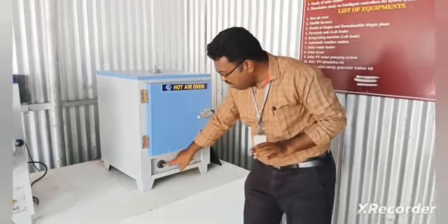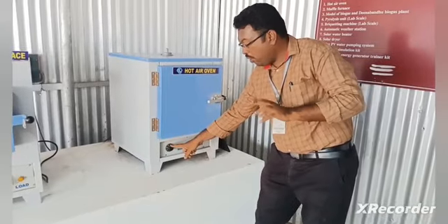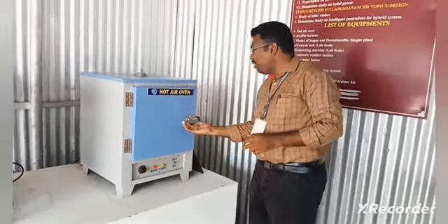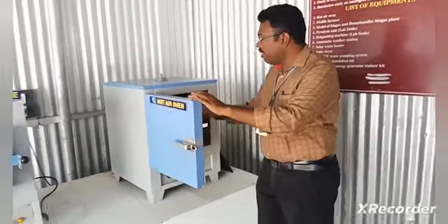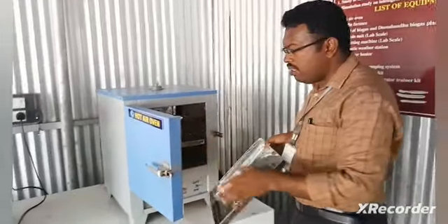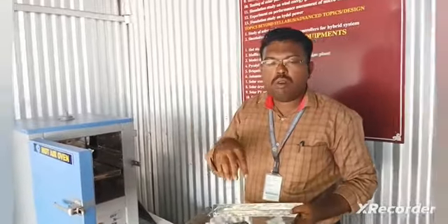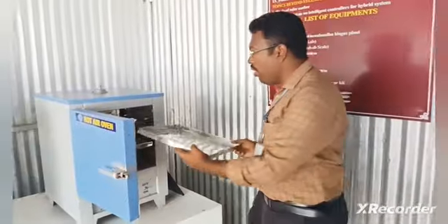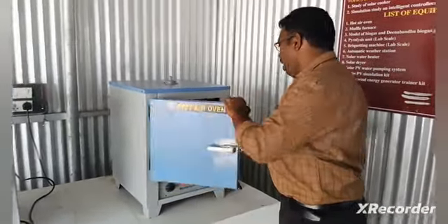This is the temperature indicator. We are going to set the temperature at which we require. First we are going to load the required biomass material, using the two trays here. We put whatever amount of biomass material we require, keep it in the hot air oven, and close the door.